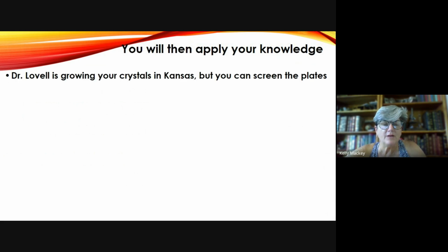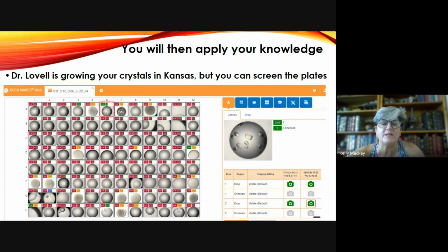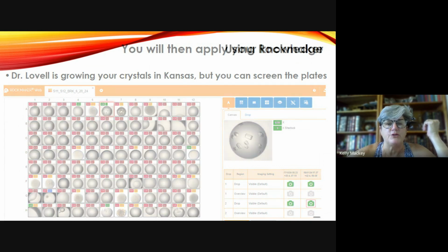We have Dr. Lovell at Kansas University, and he's growing the crystals that you're going to be working with. But thanks to Rockmaker, you can screen the plates. It will be a remote experience, but once you've actually done them in real life, it'll obviously make a lot more sense to you. Not that this doesn't make sense, but it'll be a lot easier to relate to.